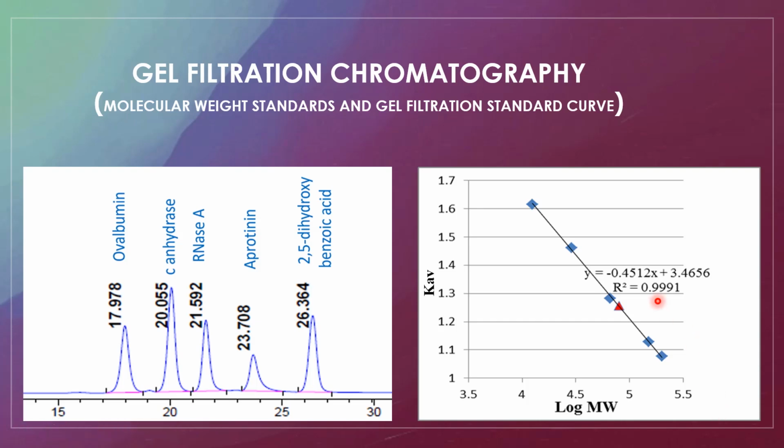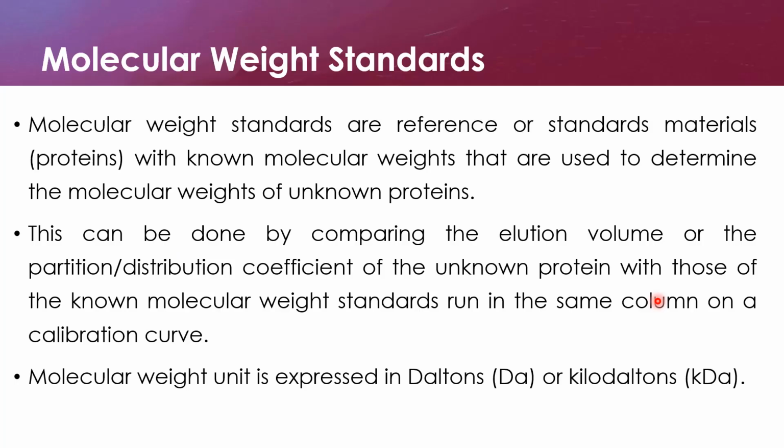In today's class and video, we are going to look at molecular weight standards in gel filtration and the plotting of the gel filtration calibration or standard curve. We'll start our introduction by looking at what molecular weight standards are in gel filtration.